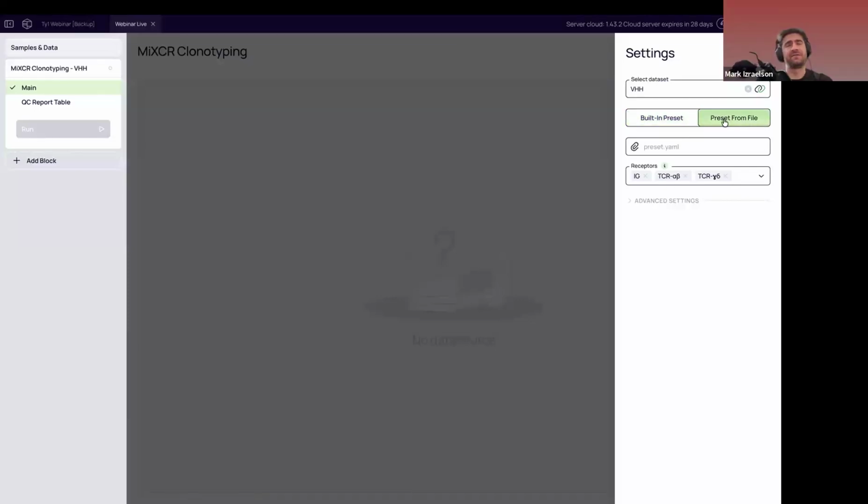support. I think that the majority of people, especially if we're talking about not academia, of course use their in-house protocols. Usually it's tuned to their specific needs, and we help them with the YAML file, with all of the settings that they need. But in academia, of course, a lot of times the regular kits are used.